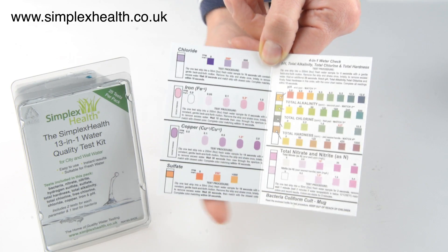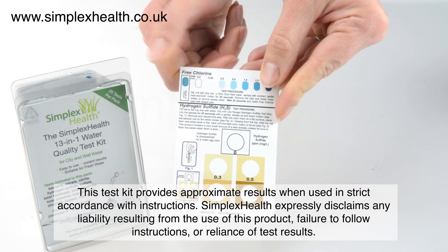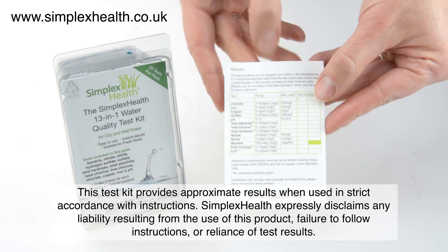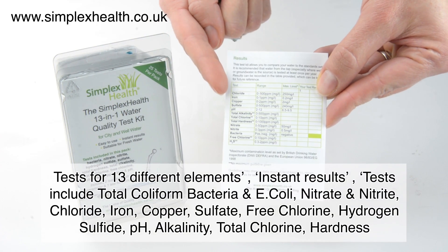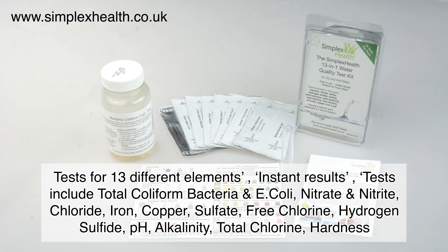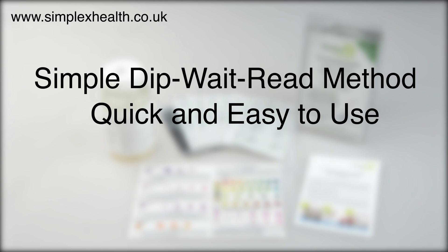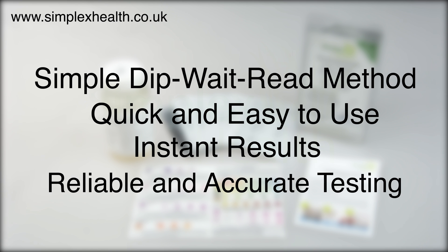Once all the tests have been completed, the test results will provide a good overview of the levels of the most common elements in water. These can be compared to local or national maximum contaminant guidelines. Please note that this is a screening test and cannot be used to declare water as safe for drinking. The Simplex Health 13-in-1 water test kits are easy to use — tests can be done at home, in a laboratory or in the field, with accurate results available within minutes.